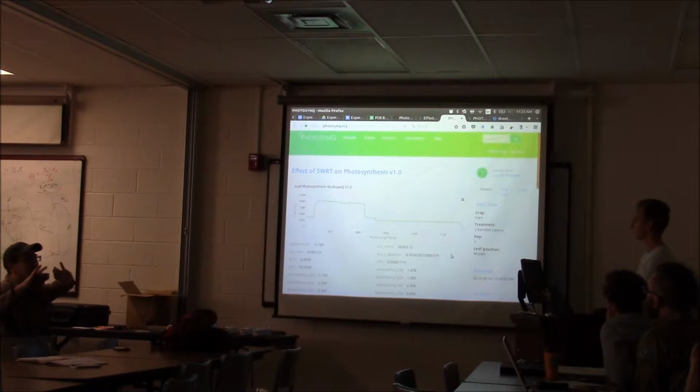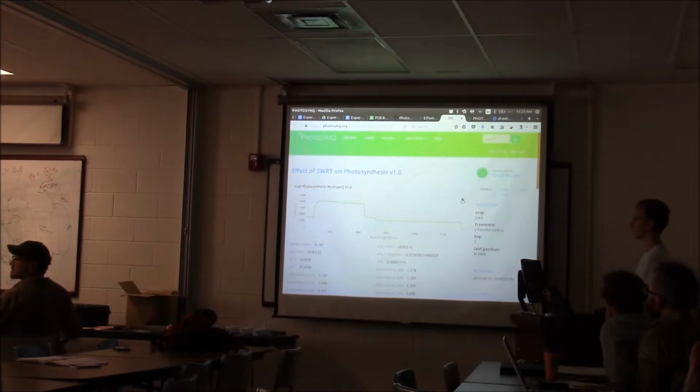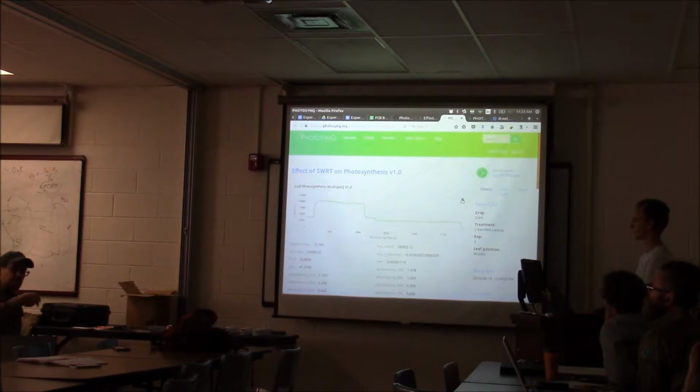Just looking at the data sets, it looks pretty interesting, so it might be possible to mine that. That's one of the reasons why Sebastian and I are developing this Python capability. So if you find something interesting, you can go in detail and pull that out and say, does it correlate with something that we don't have? And if it works, then you can include it in the platform.